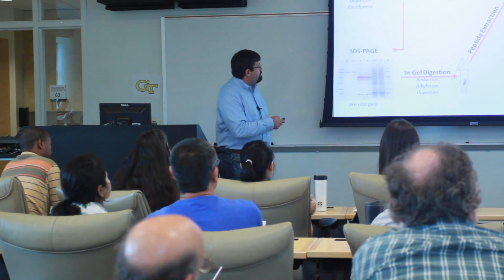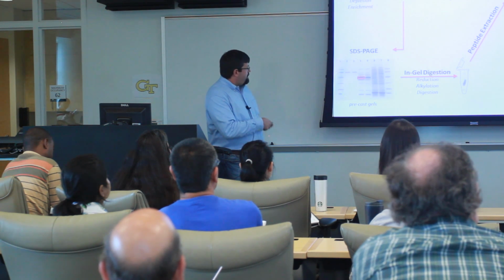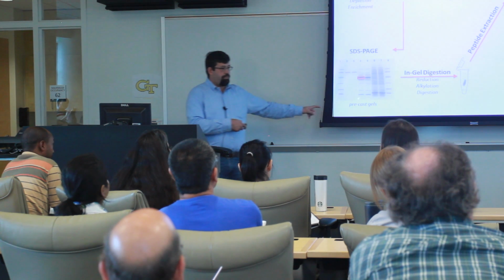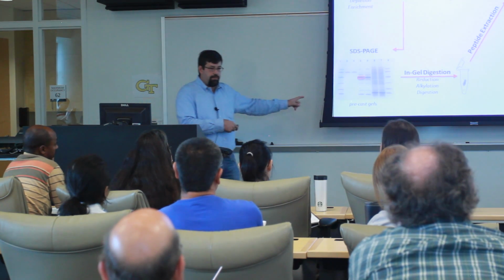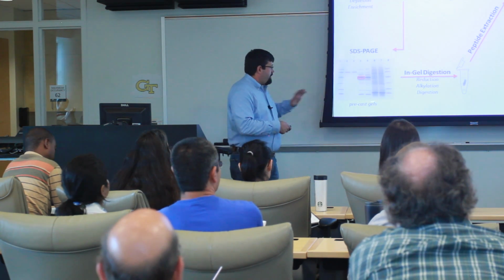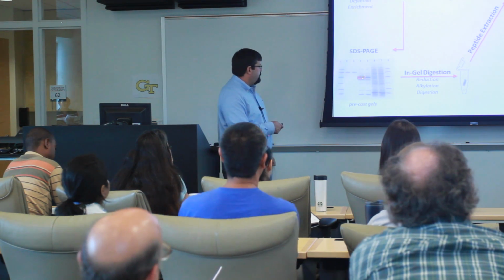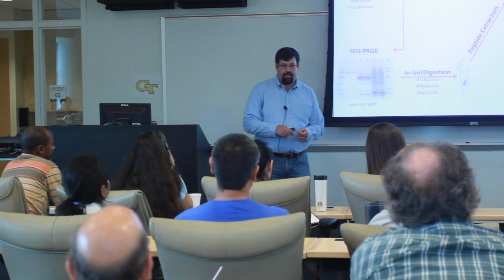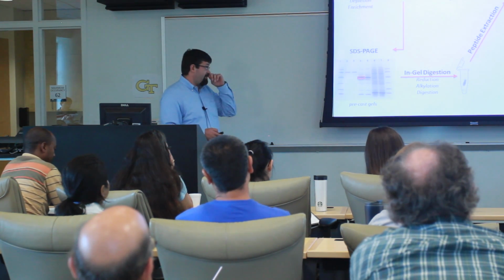You could take that protein and separate it by SDS-PAGE, as I described. And from that SDS-PAGE gel, and I would recommend precast gels for this, and we'll probably end up with some protocols online that will really help people get through some of these steps. Precast gels avoid certain contamination problems that we often see in protein mass spec. You can cut bands out, literally, just go with a razor blade and cut them out. You do have to do it carefully because you can have contamination issues.